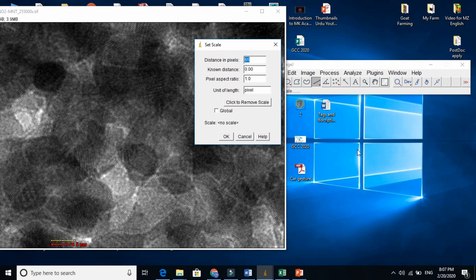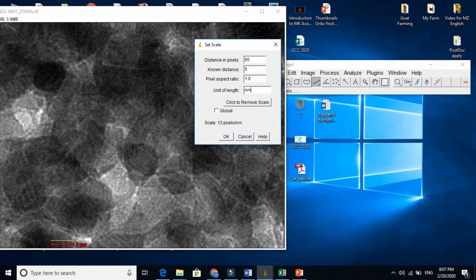So in set scale, the known distance is 5 nanometer, and the unit I need to write in nanometer. When I write this, just click OK now.